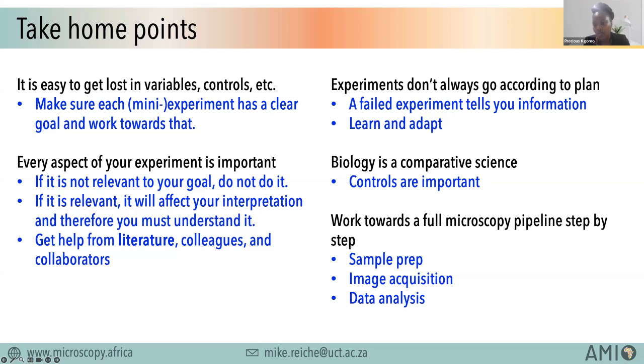Just a few considerations more than questions from my side. This is Emmanuel. As a bioimage analyst who has worked for 10 years in a bioimaging unit, I also want to suggest starting with pilot studies and not starting right away acquiring hundreds of images and then finding out that sample preparation or image acquisition was wrong. Secondly, along with the literature, I just want to emphasize if you're lucky enough to have an imaging unit, consult it before starting the experiment. It can help a lot.